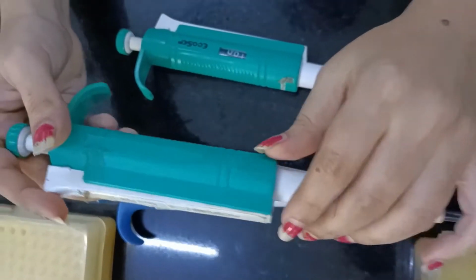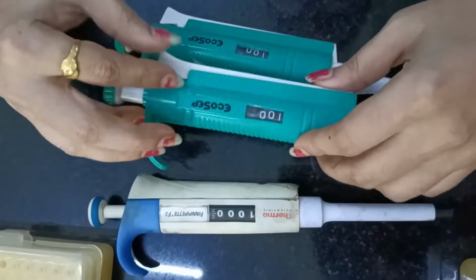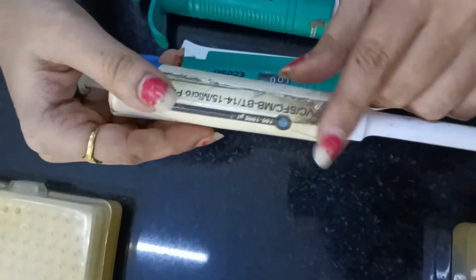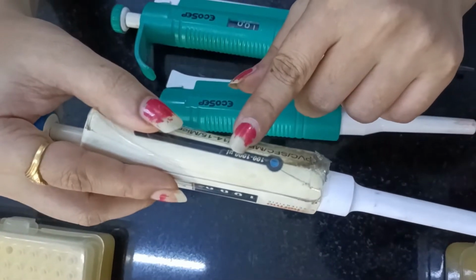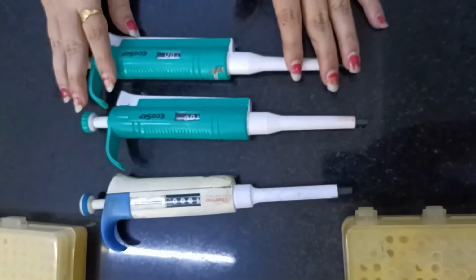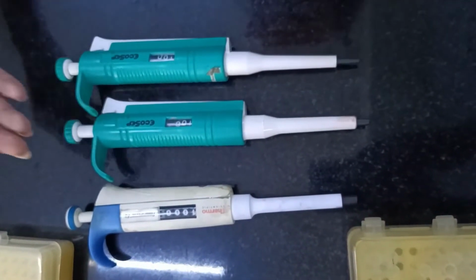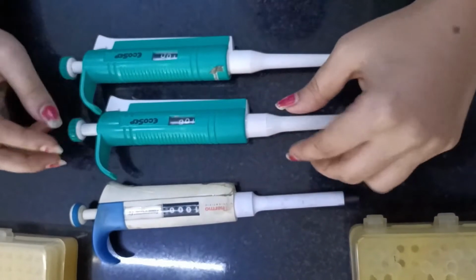Same goes for another which is of 10 to 100 microliter, followed by that which is of 100 to 1000 microliter. So as I've stated, these three are the micropipettes. Apart from it, there are different kinds of micropipettes with respect to those particular volumes.